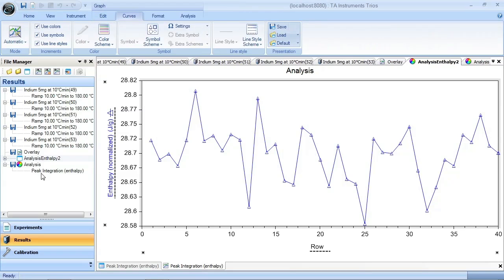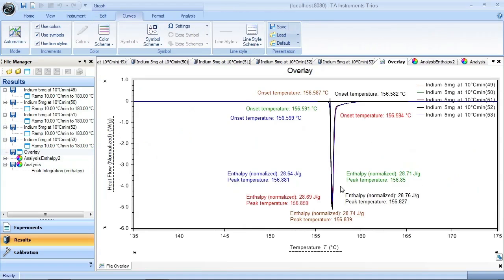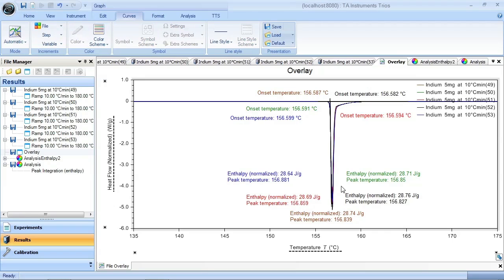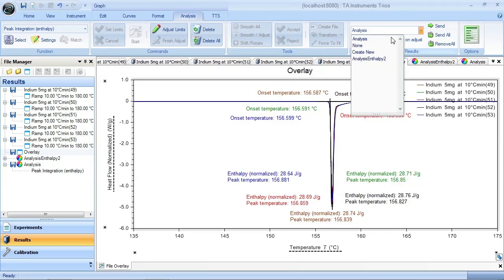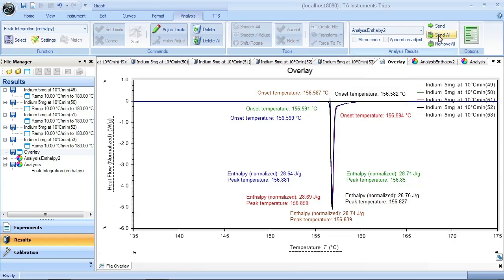And here's my graph. Now, if I want to send these results to that analysis report, I come over here and I select that analysis report, which is analysis enthalpy 2, and I say send all.